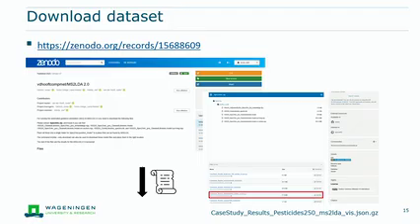So this is the next step. On the side, you can't see it on the slides here, but it's version 7 that is the most updated on the Zenodo. It's on the right-hand side. And then just this case study. Any other version with this case study would also work. That's not a problem. I would say maybe 5 more minutes and then we move on.